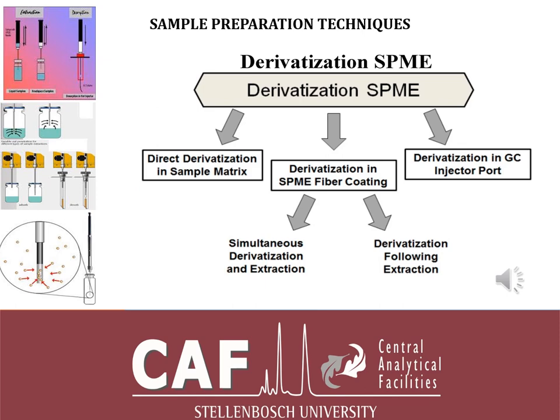If one is doing the derivatization in the SPME fiber coating, that is on-fiber, you can do simultaneous derivatization and extraction, or a derivatization following extraction. The simultaneous derivatization and extraction is everything together: the derivatizing agent gets absorbed on the fiber, and then from there on, in the sample.